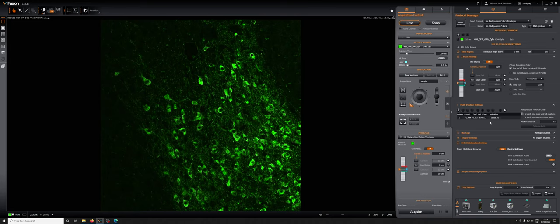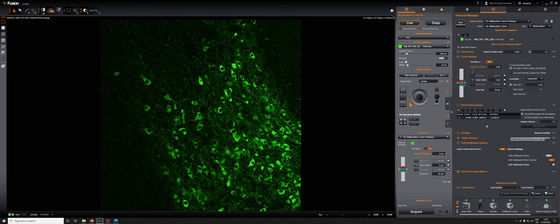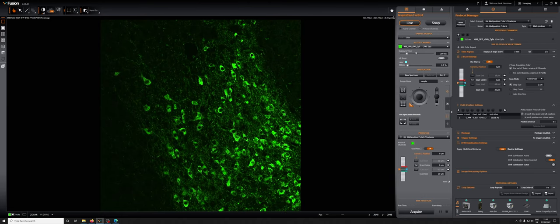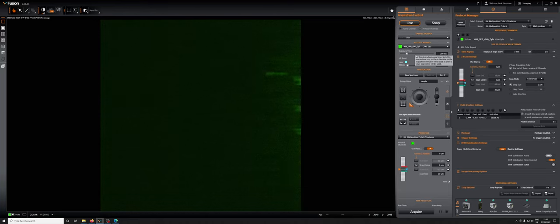Now that we've added the first point and we've clicked drift stabilization off, we're in a situation where we can add another position. Let me do that now. I'm still on live, I'm just going to move laterally. I've actually tilted this slide a little bit to make it easier to see that we need to change the focus.